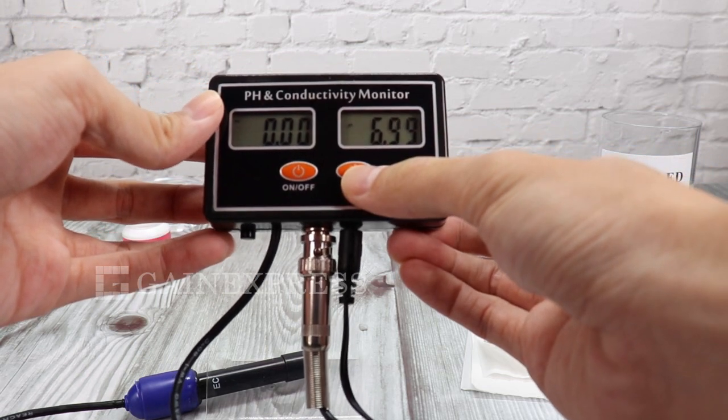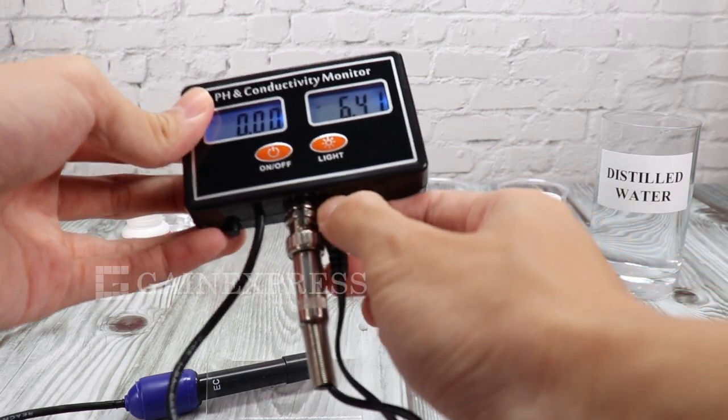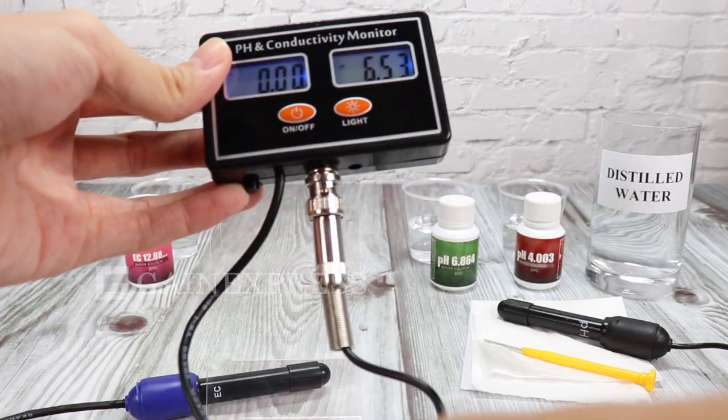It is rechargeable and you can remove the adapter if it has charge. When the battery symbol appears, connect to the power adapter immediately.